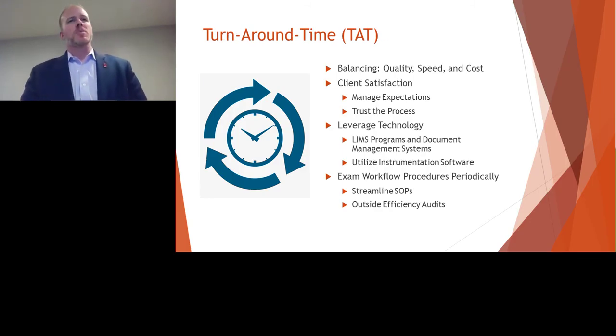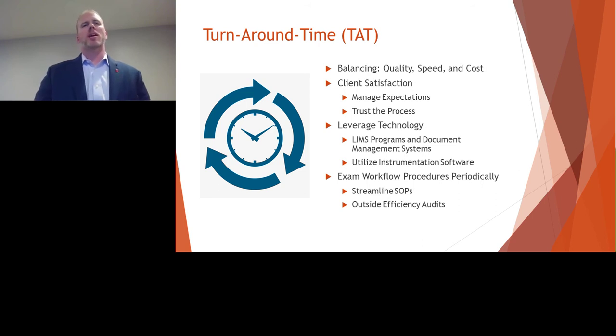So, turnaround time. Everybody can do pretty much anything as far as analytics and producing data, but it's always about trying to find the balance between doing quality work, how quickly you can get it to somebody, and the cost. Those are the three big pillars. They always say I can do something of high quality, it may take a while and it can be cost effective, but if you want high quality and you want it fast, it becomes very expensive.